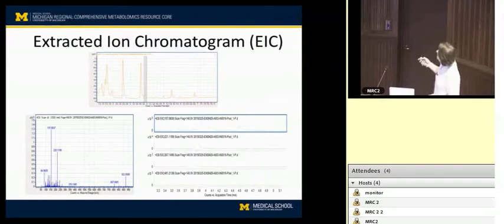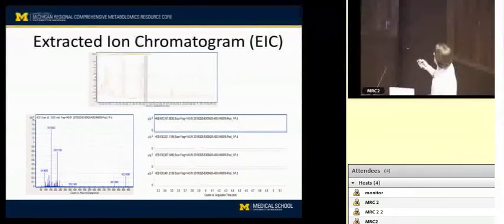Okay, so again, going back to, if I just took this little slice right here, which is a broad peak, but again, this doesn't represent one compound. It represents all the compounds coming out at this time. And I took the top several ions here and did an extracted ion chromatogram. This is what it would look like. I distinctly see that there is some separation, possibly baseline separation between this ion, which is the 157 Dalton ion here, and this one, which is the 221. So they are separated, don't really overlap.